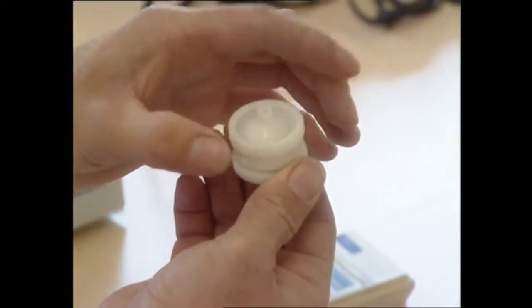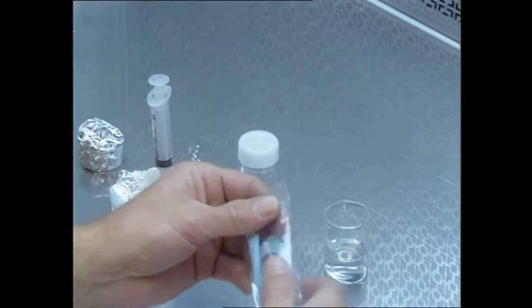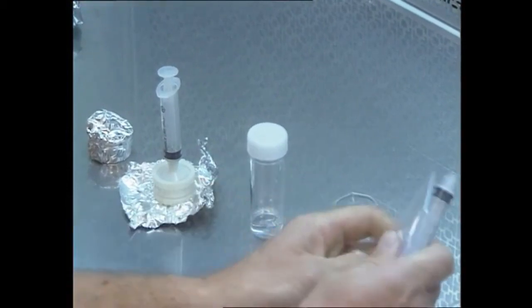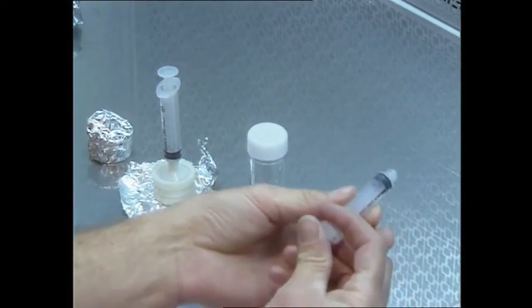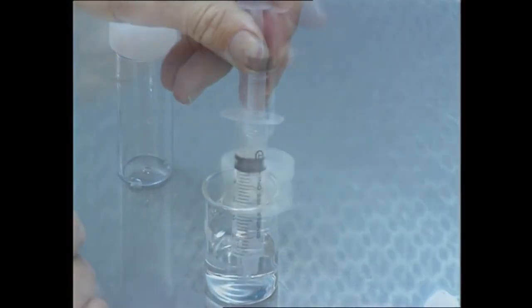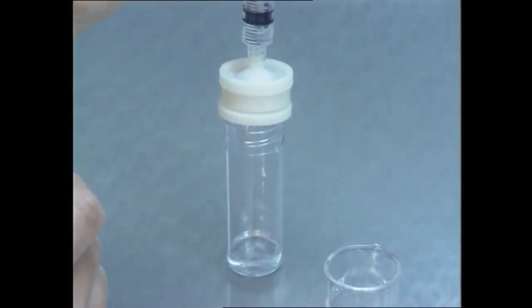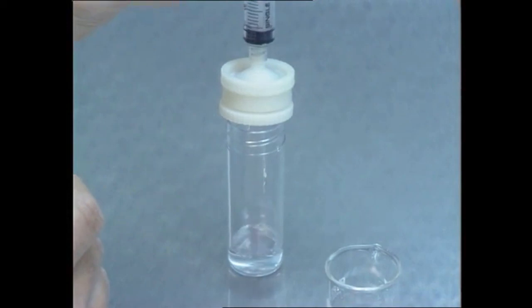All the instruments and equipment needing to be used must be either autoclaved or soaked in 95% alcohol. For example, the hypodermic syringe, the container in which the compound in question is going to be filtered into. The compound in question is drawn into a hypodermic syringe and then passed through the filter like this in a laminar flow cabinet or any other clean environment.